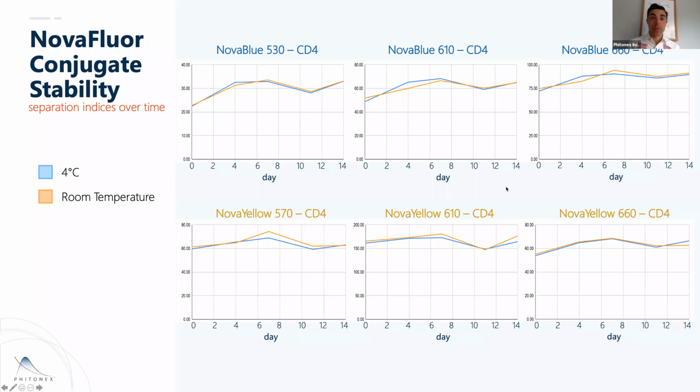Similarly, I would say we have a similar paradigm when it comes to consistency. We've been ordering tons of antibodies, as you've seen, and one of the things we've seen is high variability, lot to lot. And a lot of that, antibody manufacturing is pretty simple, honestly, so in our hands a lot of that is down to the fluorophore variability, right? The ones that we get from other vendors. And so we said, look, that's unacceptable.